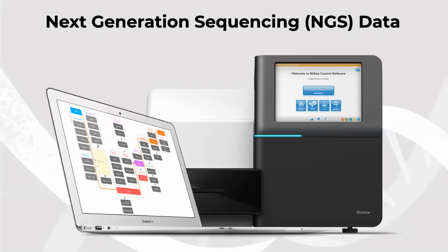And so one of the popular techniques to quantify mRNA without any kind of targeted sequences that we're looking for, so just kind of looking at everything that is being expressed, is next generation sequencing based on the Illumina protocol. And as you remember, what we discussed is one of the challenges is really having this detailed process of extracting the useful information from all of the sequencing reads.